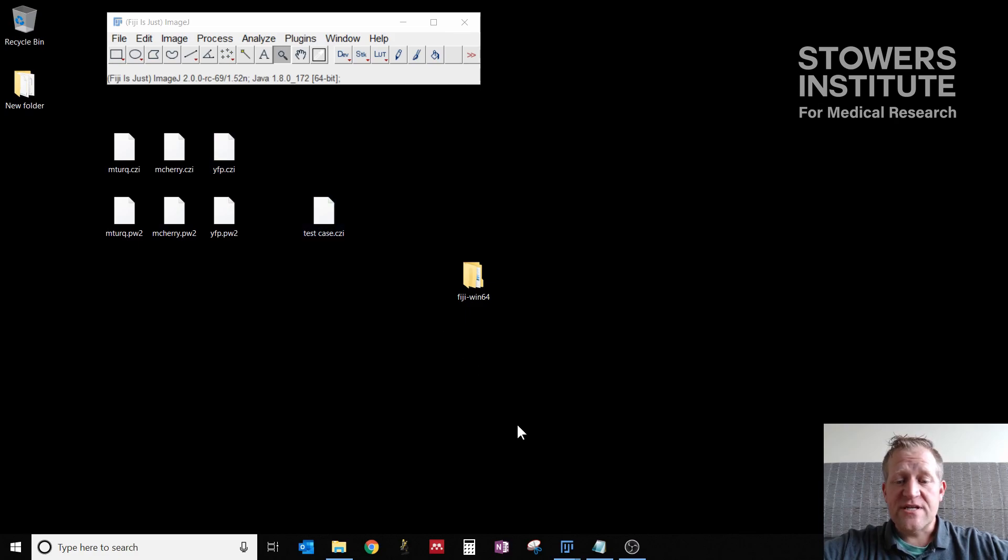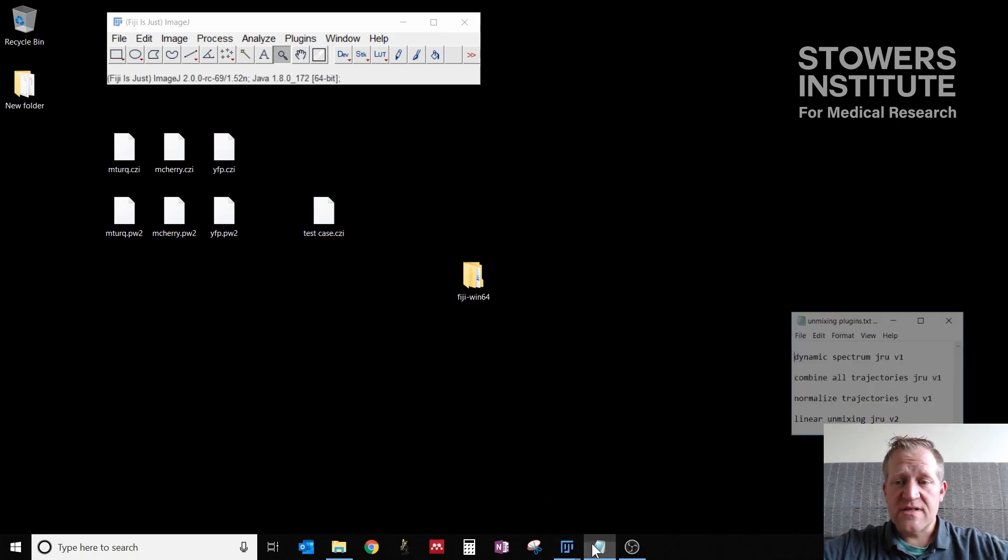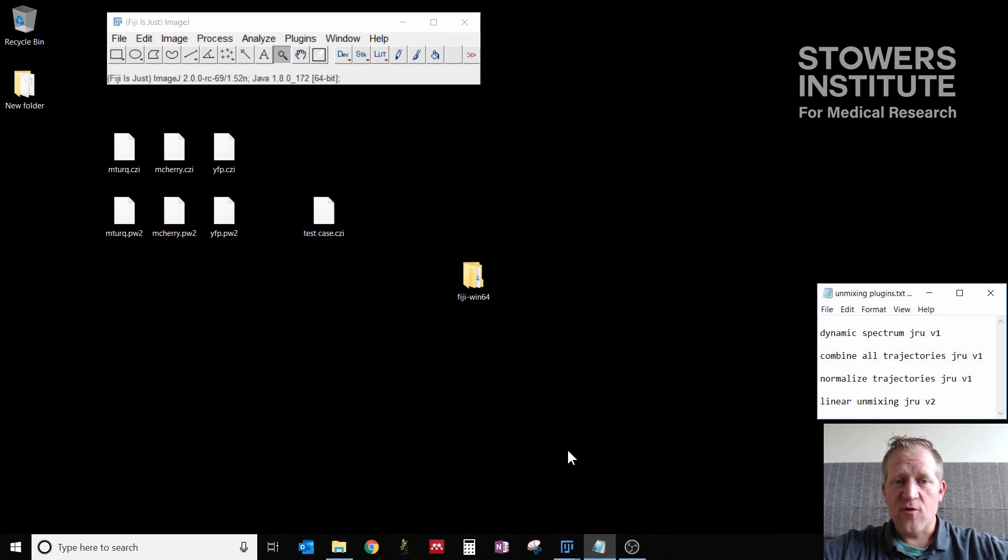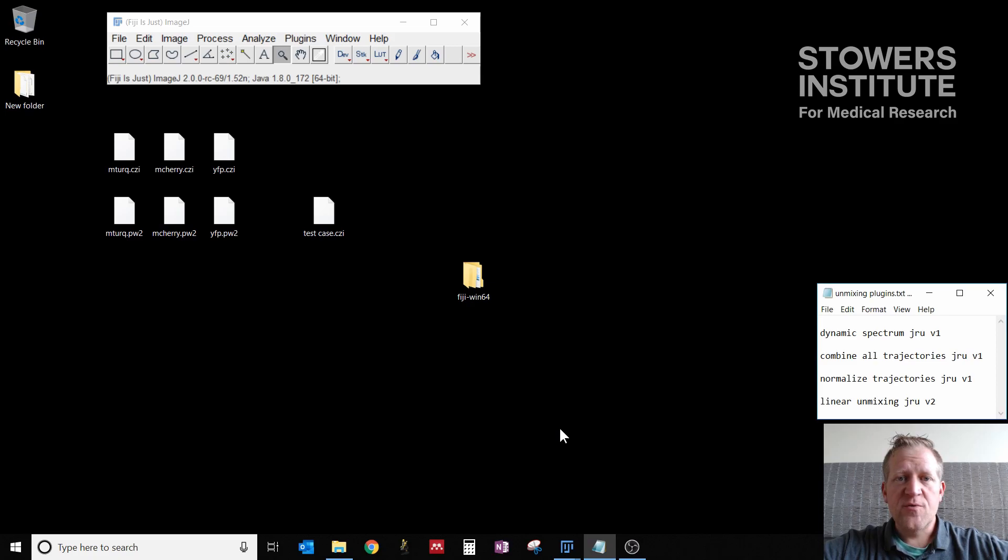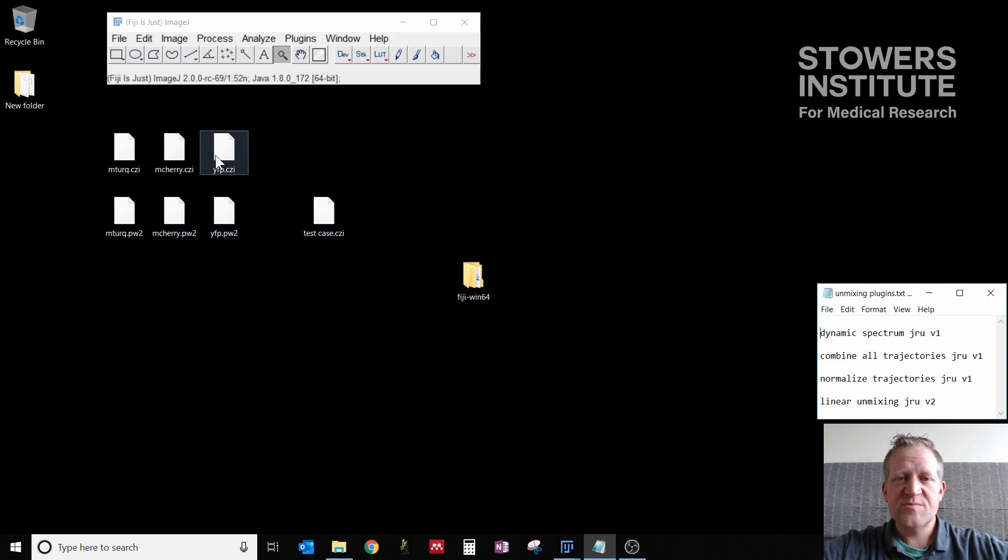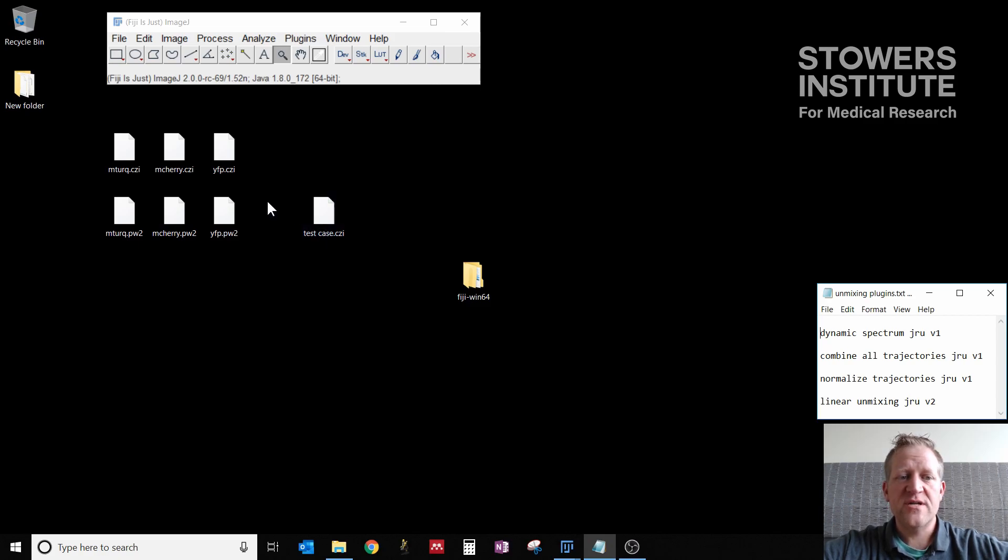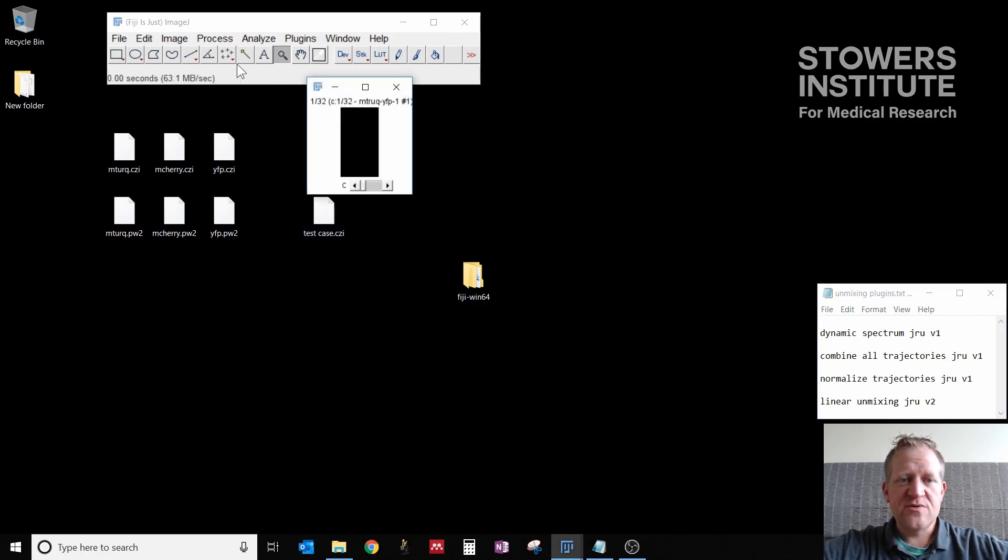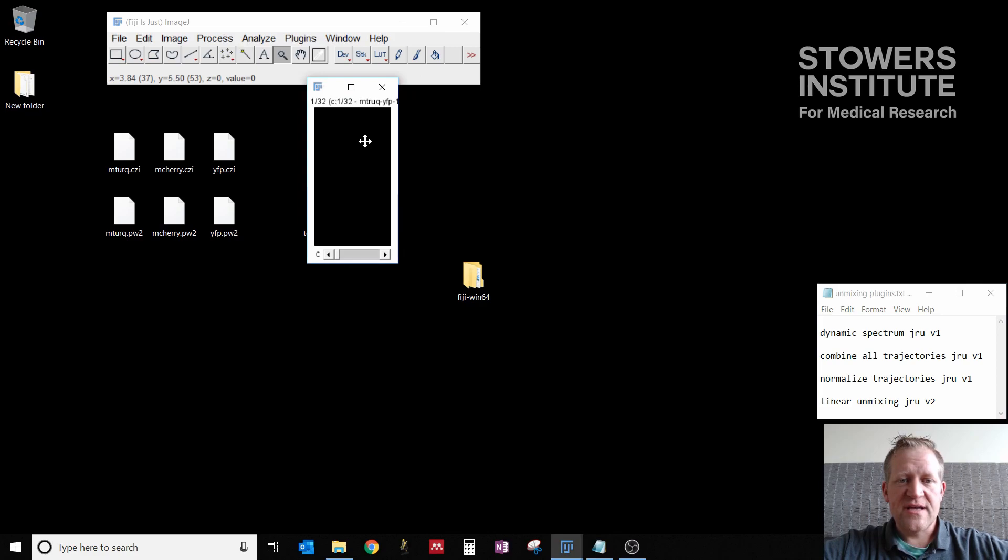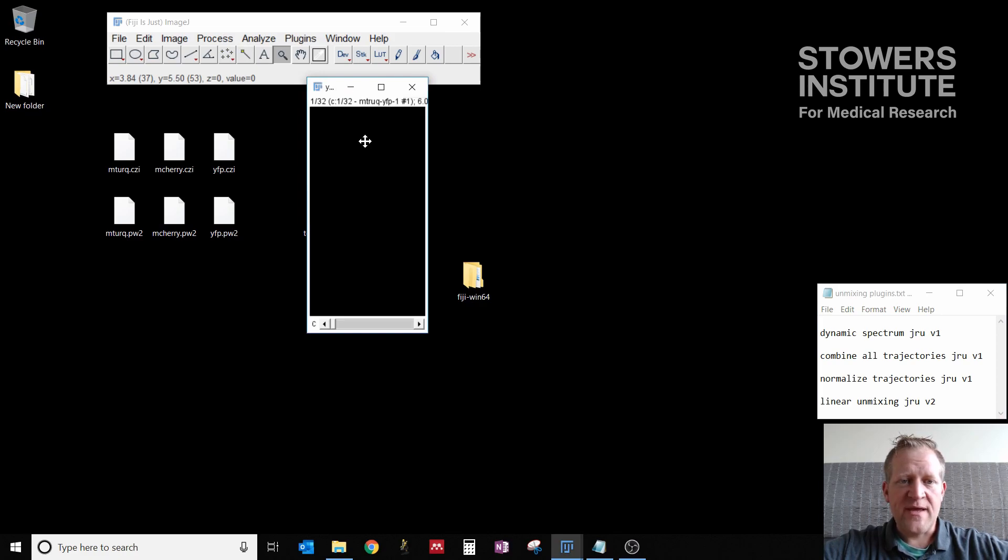To do that, we're going to use a series of plugins. The idea is that we're going to go through three control images that express only each FP, and then we're going to get spectra for those and use those spectra to unmix a test case image. So load your first image. We have a cell here expressing YFP.